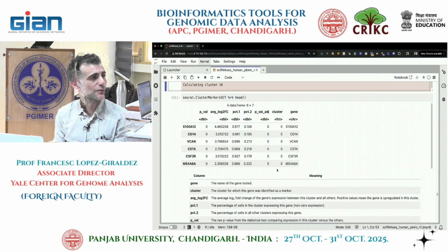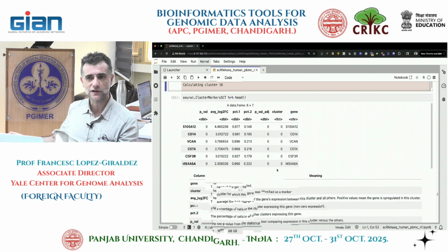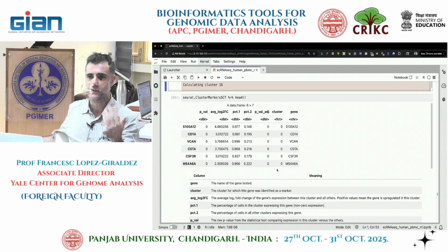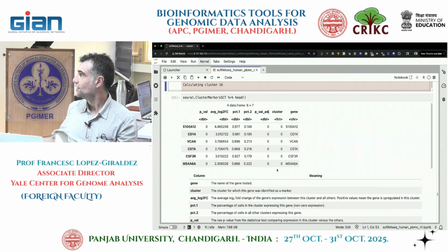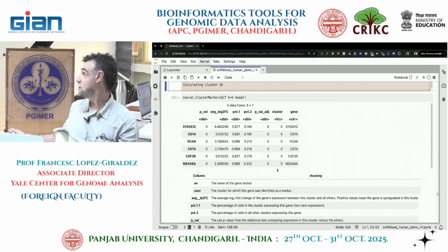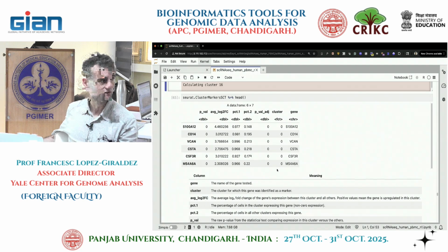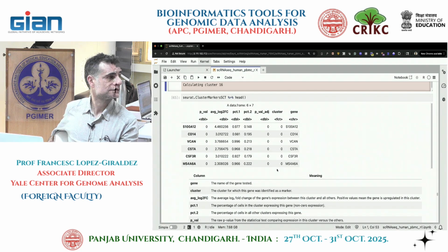The other one, I'm not that good at it, but you can Google it and figure out if they are markers of that cell type. Those are monocyte markers. You convinced me now, cluster 0 are monocytes.